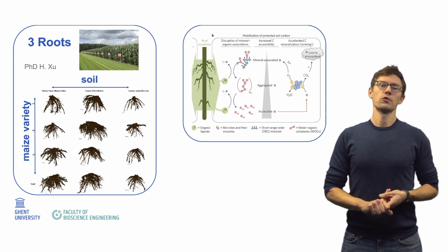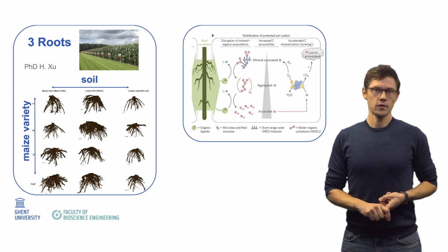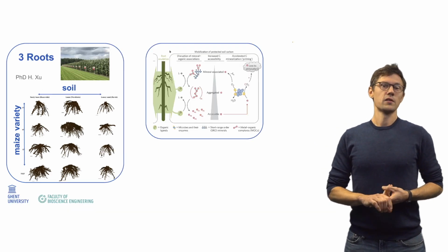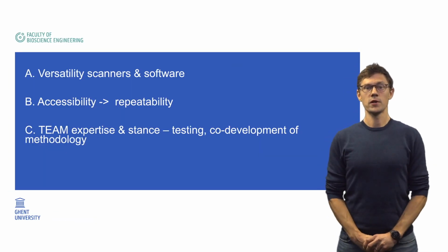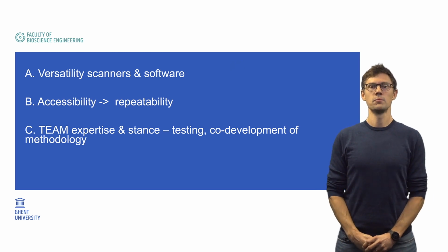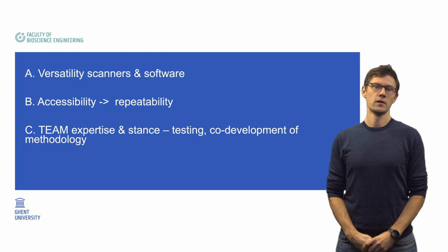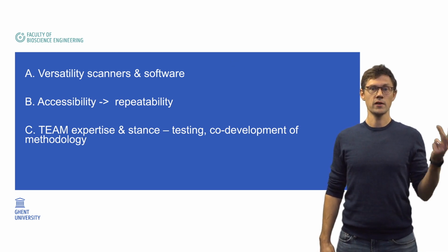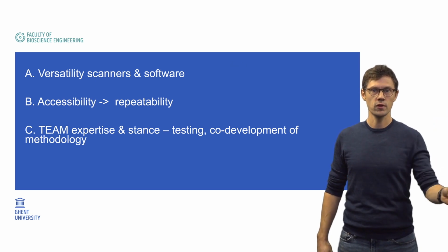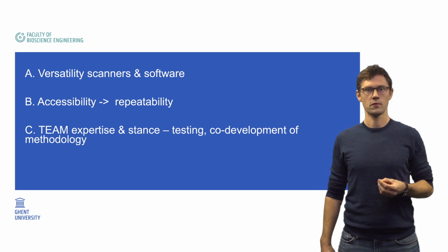In future, we would also like to integrate CT to unravel how roots interact with organic matter and soil structure and test conceptual models. With this, I'd like to end my talk, and in summary, teaming up with the core facility advanced our research by the excellent versatility of their instruments and software, as it allowed us to work on a very small scale and get insight with good resolution and phase contrast in soils.